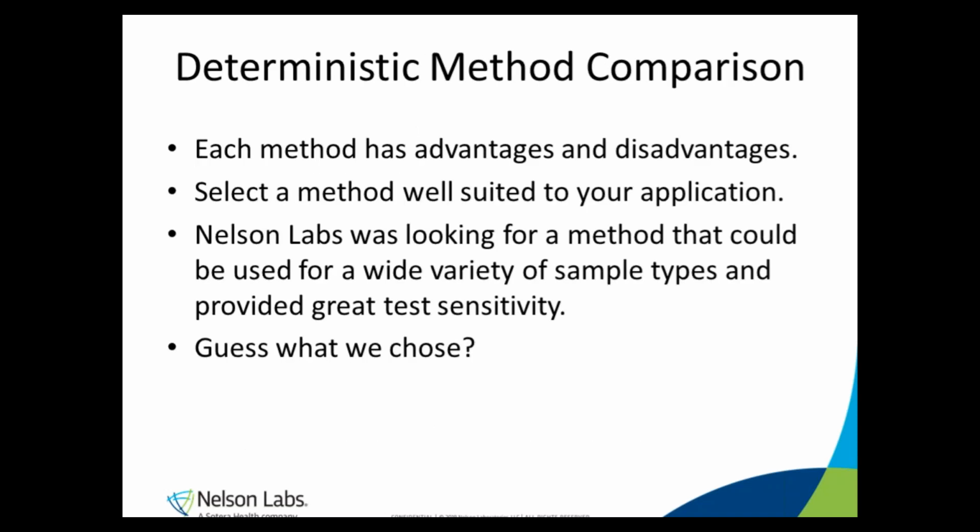So which deterministic method, remember there were quite a few on the list, is the best option? Well, this depends on a lot of factors. Each method has advantages and disadvantages. For example, a laser headspace is fantastic for containers packaged under alternate atmospheres. But if you package with ambient air, then you would need to condition the samples in nitrogen or some other gas prior to testing, and well, that adds some time and expense.